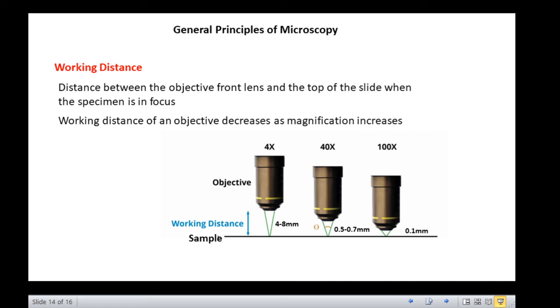What is critically important here is the angle. Remember the angular aperture A? Half of it is theta. Do you remember the formula for numerical aperture? Yes, it is NA is equal to n sin theta. So, greater the value of theta, greater will be the value of NA.